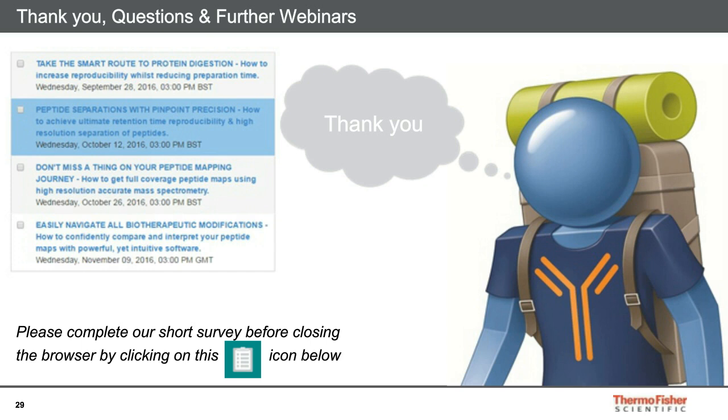So as I explained earlier in the presentation, by doing that, you get rid of the pressure drop you normally have with a normal UHPLC system that does not have this feature.